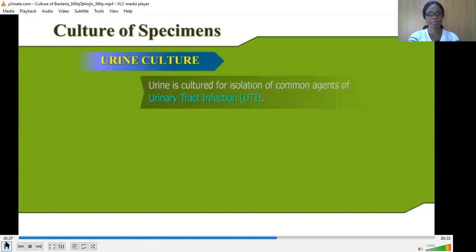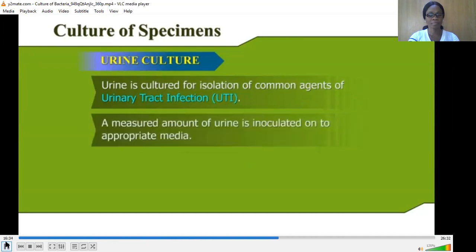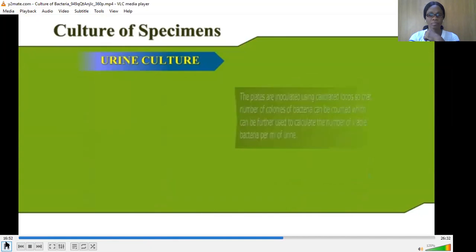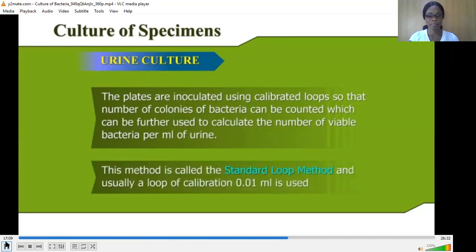Urine culture. Urine is cultured for isolation of common agents of urinary tract infection. A measured amount of urine is inoculated onto appropriate media. Use of blood agar and MacConkey agar allows detection of most gram-negative bacilli and gram-positive cocci. The urine should be mixed thoroughly before plating. The plates are inoculated using calibrated loops so that the number of colonies of bacteria can be counted, which can be further used to calculate the number of viable bacteria per milliliter of urine. This method is called the standard loop method, and usually a loop of calibration 0.01 milliliters is used.